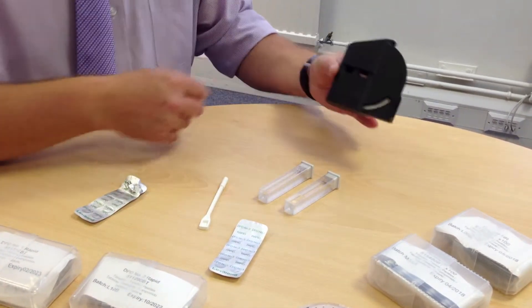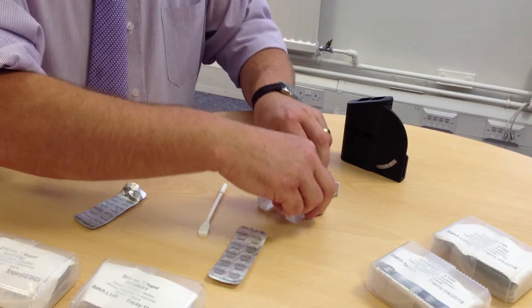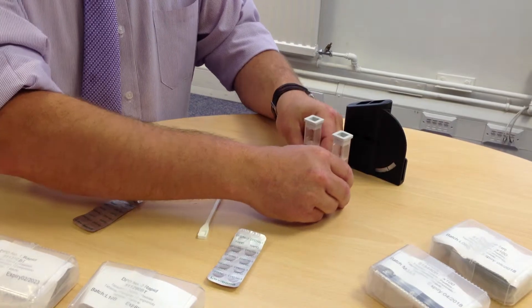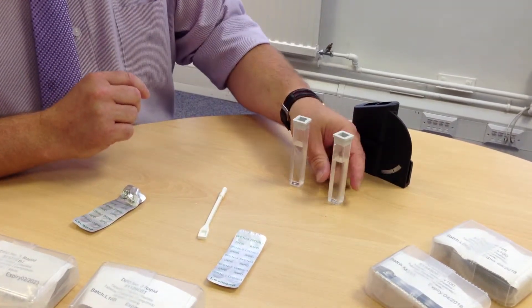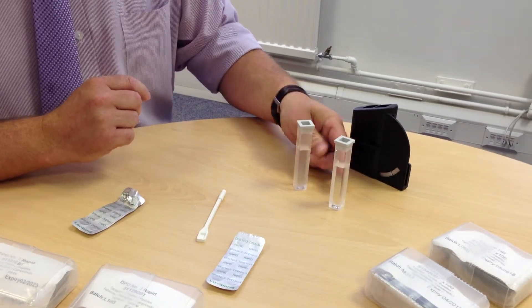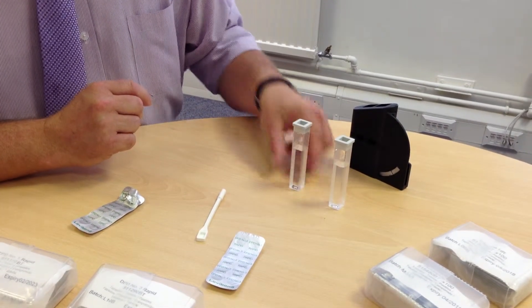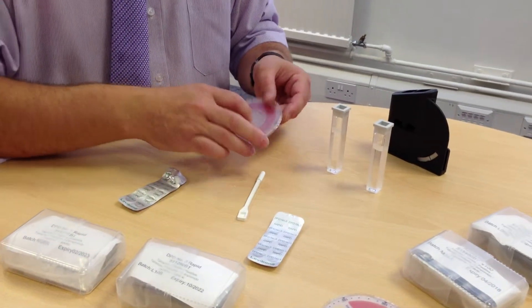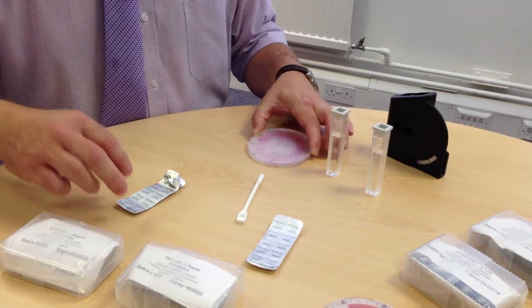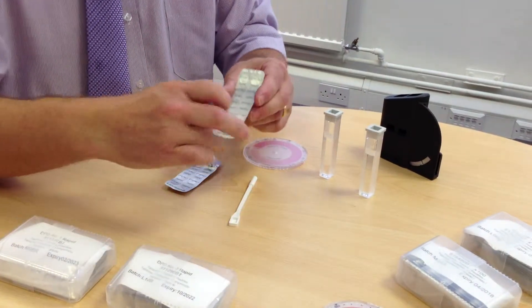Using the comparator system is very simple and easy to use. You have two test cells — one is used as a blank and the other is your testing cell, which you add your tablet to. We are now going to do the 0 to 1 ppm test which uses the DPD number 1 tablets or the DPD number 3 tablets.